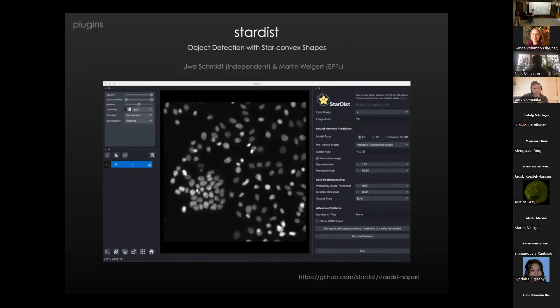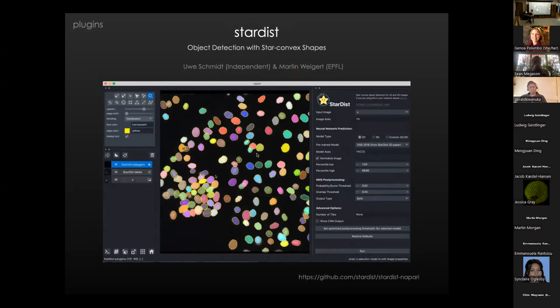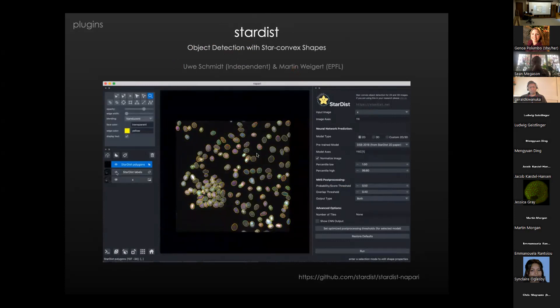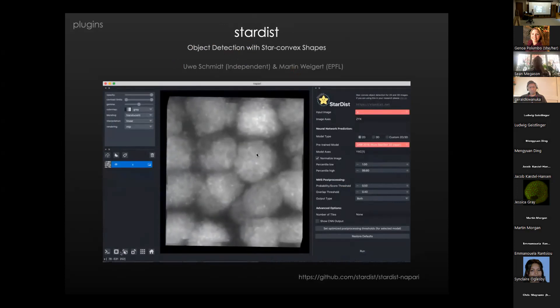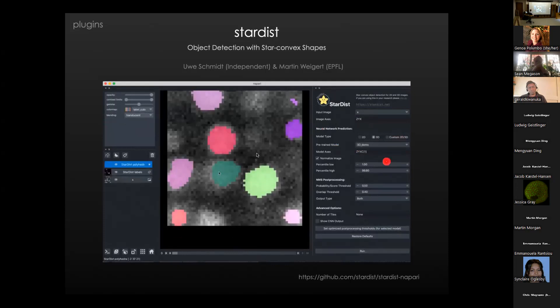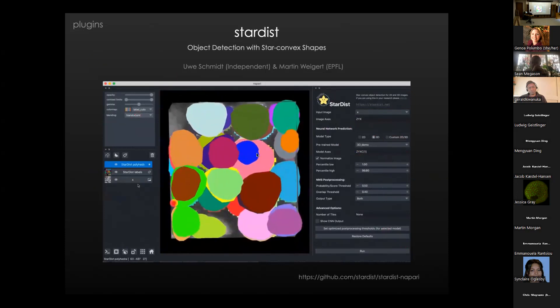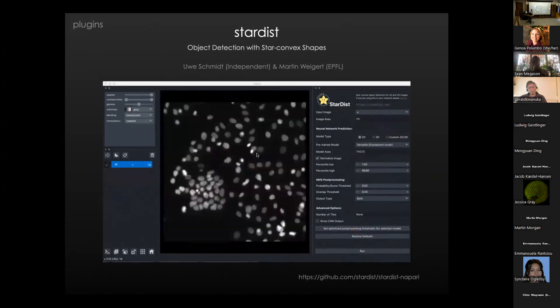StarDist is a plugin written by Martin Weigert and Uwe Schmidt — now in Switzerland — and it is a great tool for segmentation of nuclei, based on TensorFlow. They do have an ImageJ plugin, but from the developer's perspective, if the thing is already written in TensorFlow it is very easy to add a Python plugin. It's a little harder to go across languages. Here they just open some images, direct the input image, run the model, and get a labels layer out that you can use to analyze some nuclei.